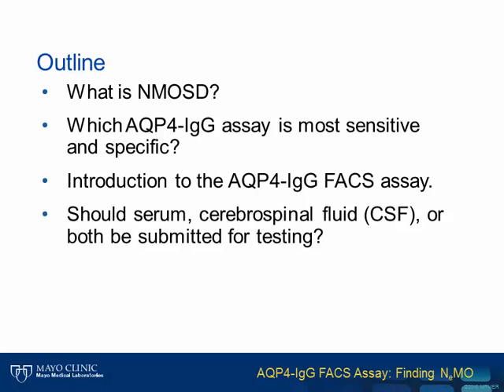So first of all, the outline of my talk is to give you an overview of what neuromyelitis optica spectrum disorders are. I'm then going to talk a little bit about the different assays that have been used to detect the water channel antibody, and show you that this is an assay that is most sensitive and specific for the detection of this antibody. And then I'm going to introduce you to the actual FACS assay itself and show you how we actually interpret the findings and how we decide on whether a patient is positive or negative. And then I'm going to talk to you about what the optimal specimen type is for testing.